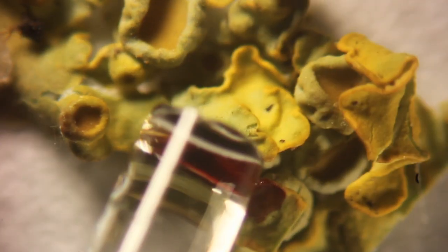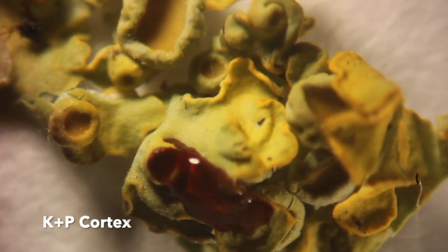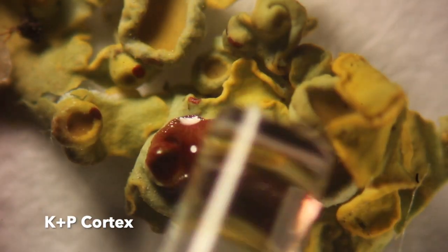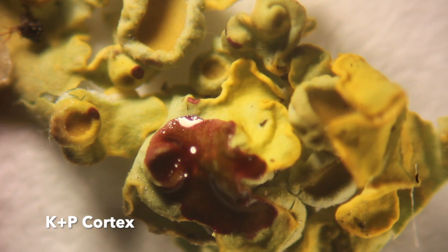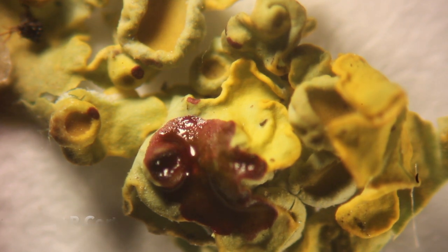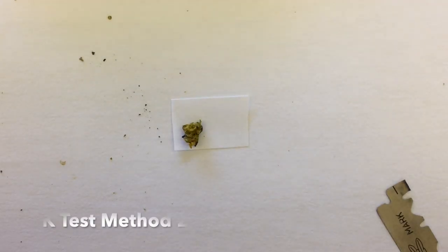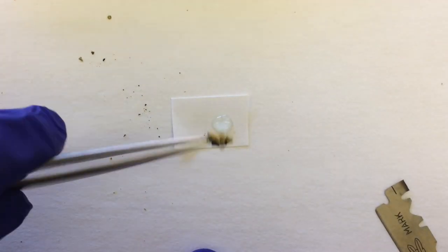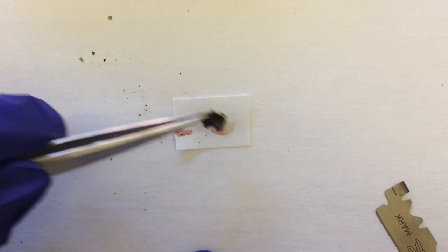Let's see that reaction up close. You can see this reaction is immediate, and that beautiful purple color on the cortex is indicative of a positive K plus P reaction. Sometimes, if you have fewer samples, it's easier to just use a piece of scrap paper and a drop of the reagent.